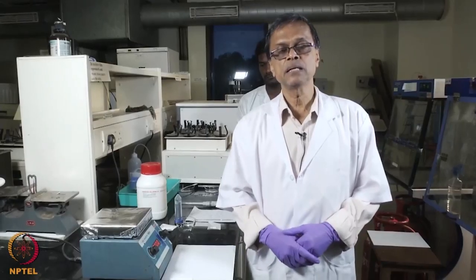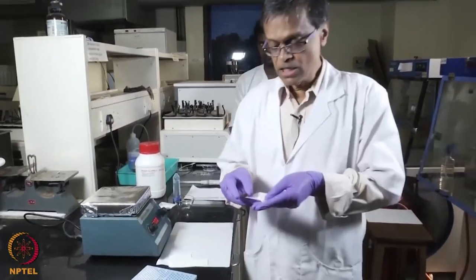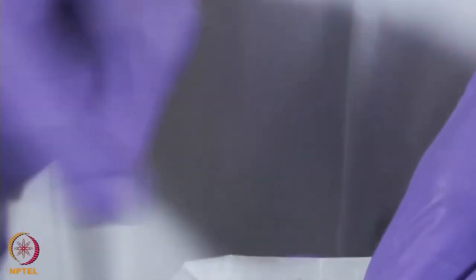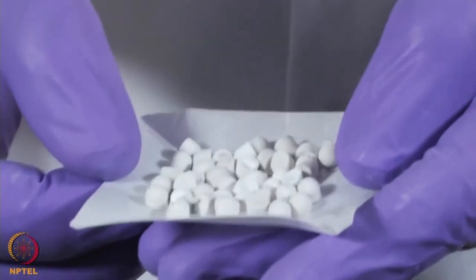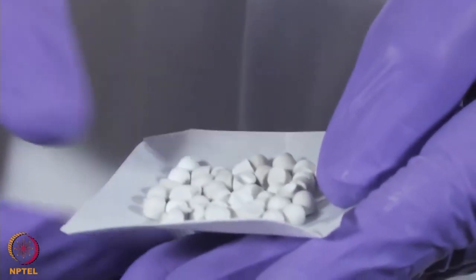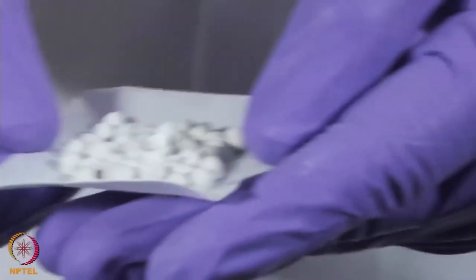We will look at how to make beads of calcium sulphate. For example, these are 4 mm calcium sulphate beads and they are used in bone filling and bone defects after an orthopaedic surgery. Calcium sulphate as you know is biocompatible, so it also prevents biofilm formation.